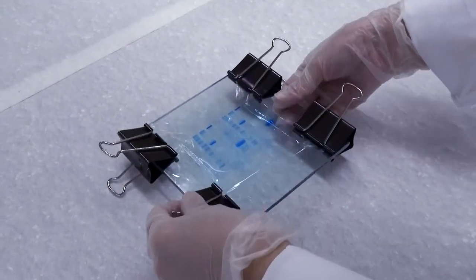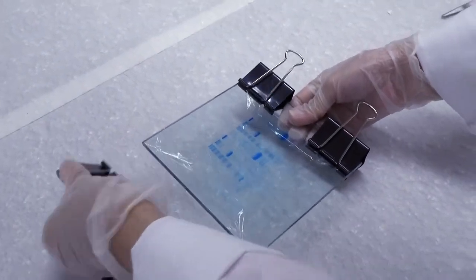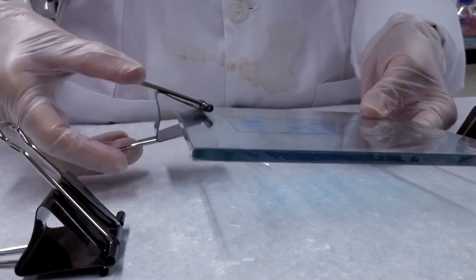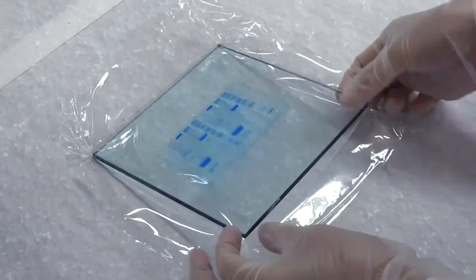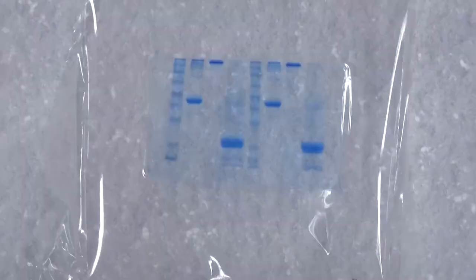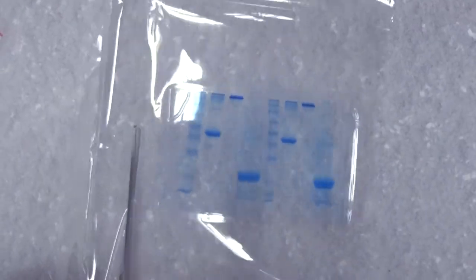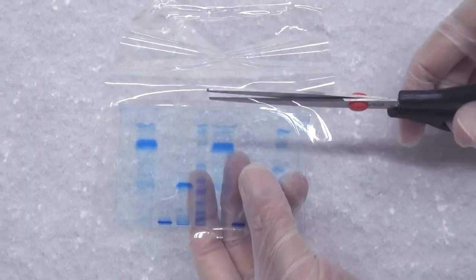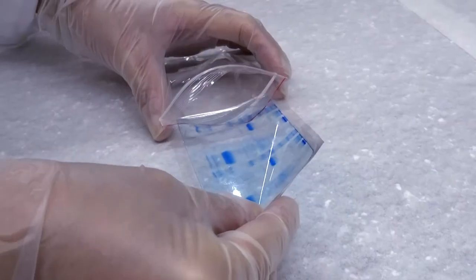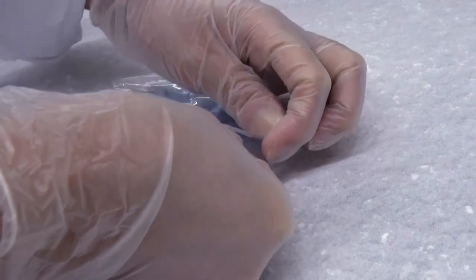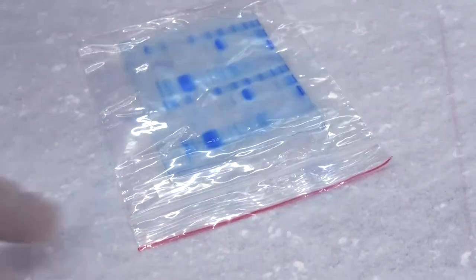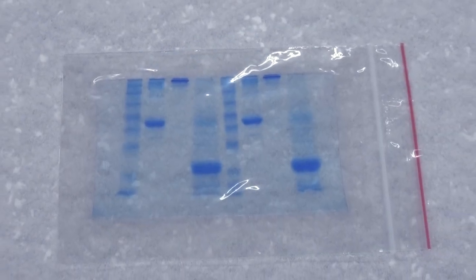After one to two days, the gel will be dry and ready to be removed. Cut unwanted food wrap around the gel with a pair of scissors. Put the gel into a ziplock bag for long-term storage. Your gel has been sealed and stored.